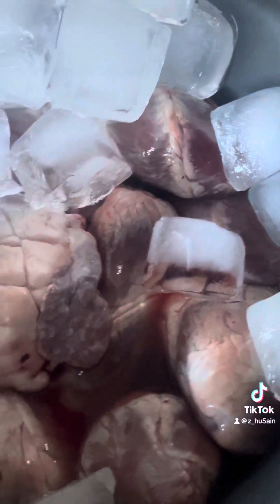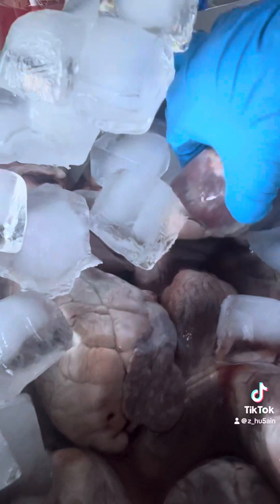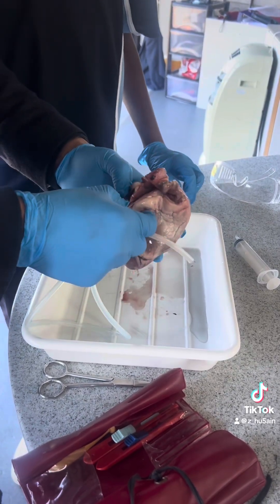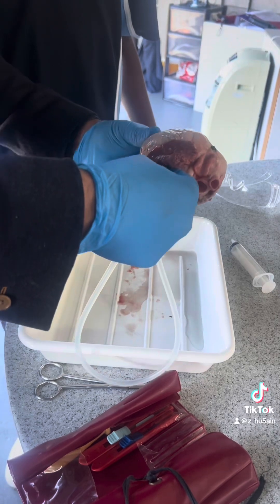Oh, there's blood. You got gloves on? Look at the size of this. Trying to feed this through. That's the front of the heart. So look at these things here. Let's try and feed that through, see if it comes out. You can see that there.